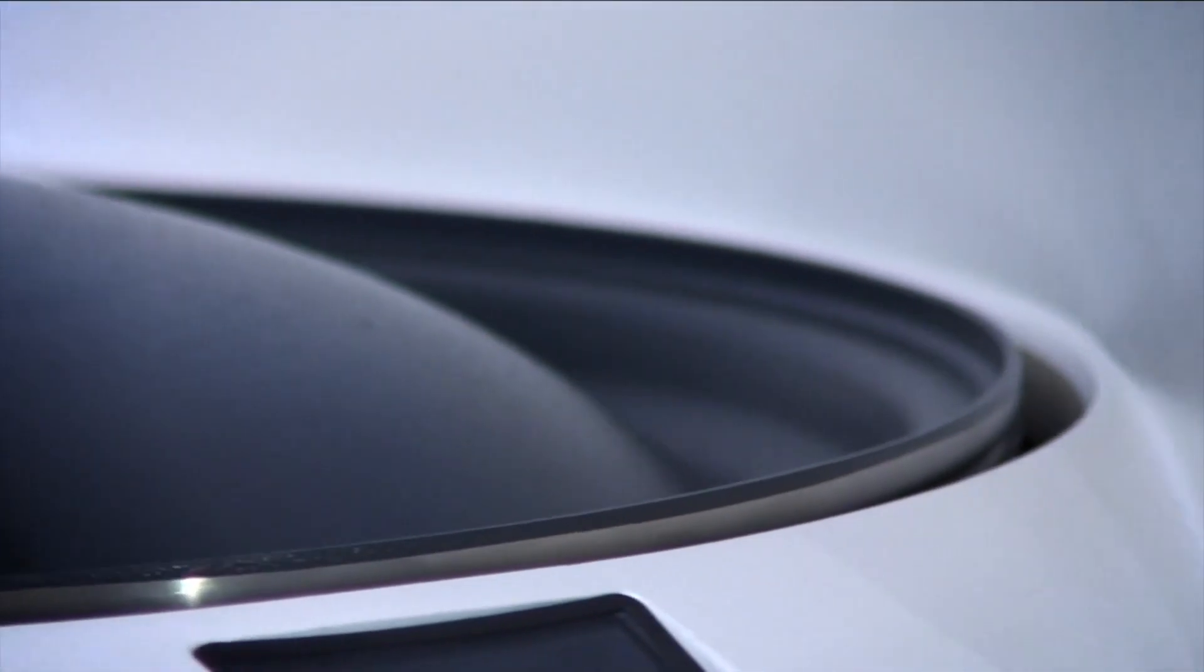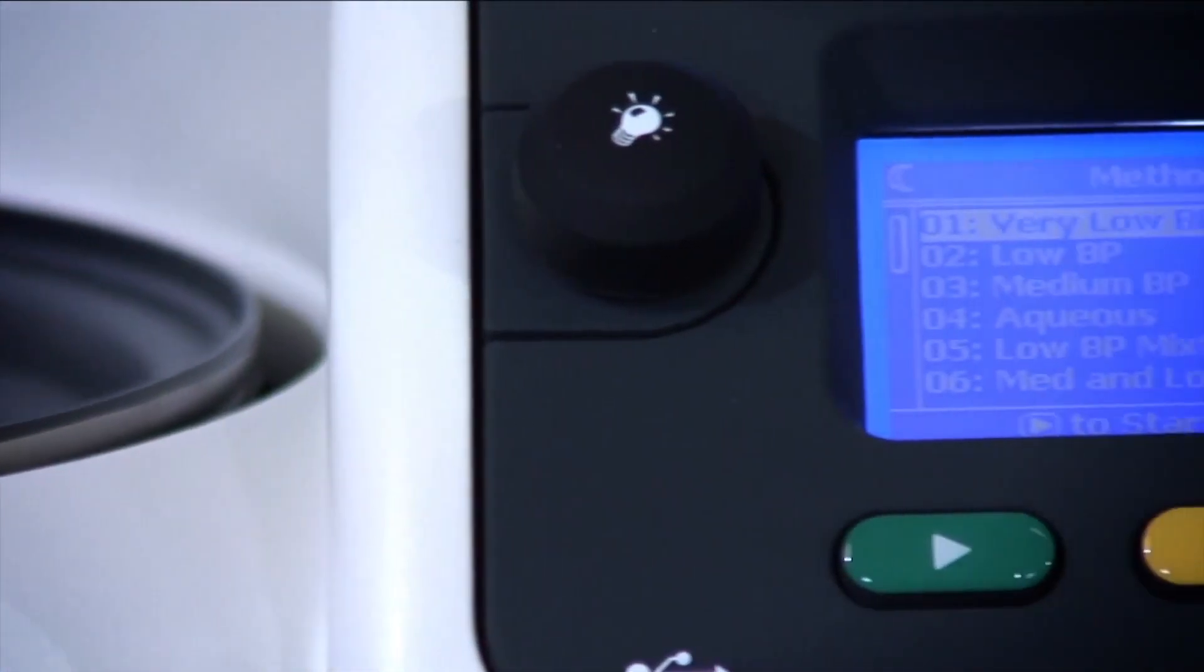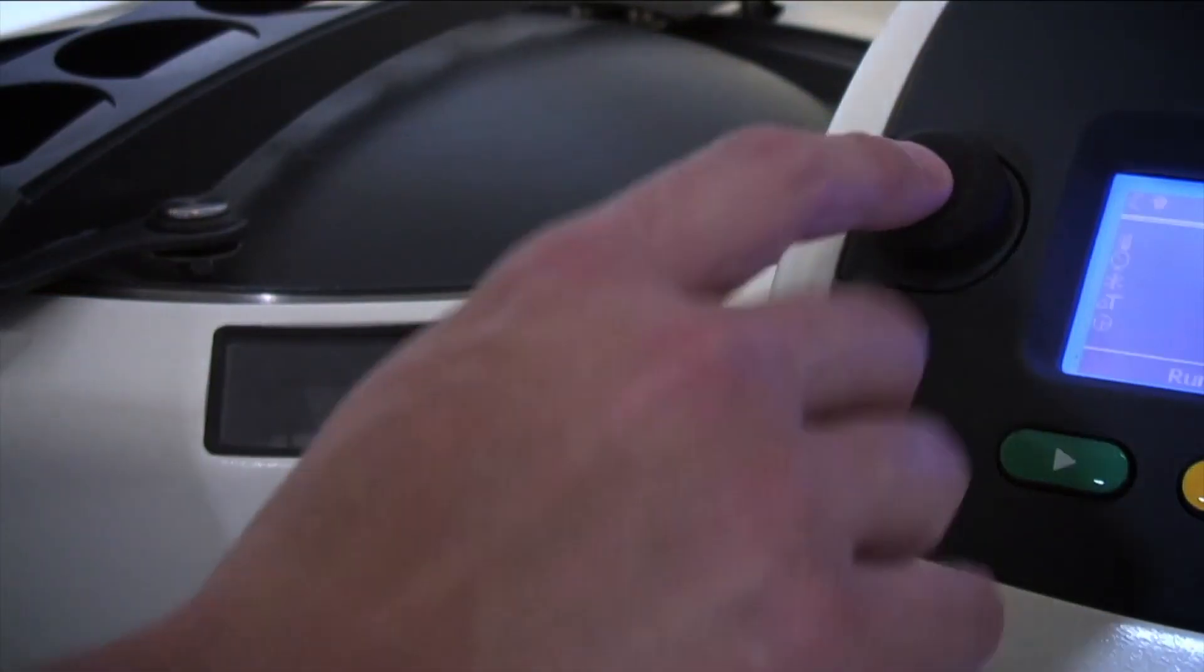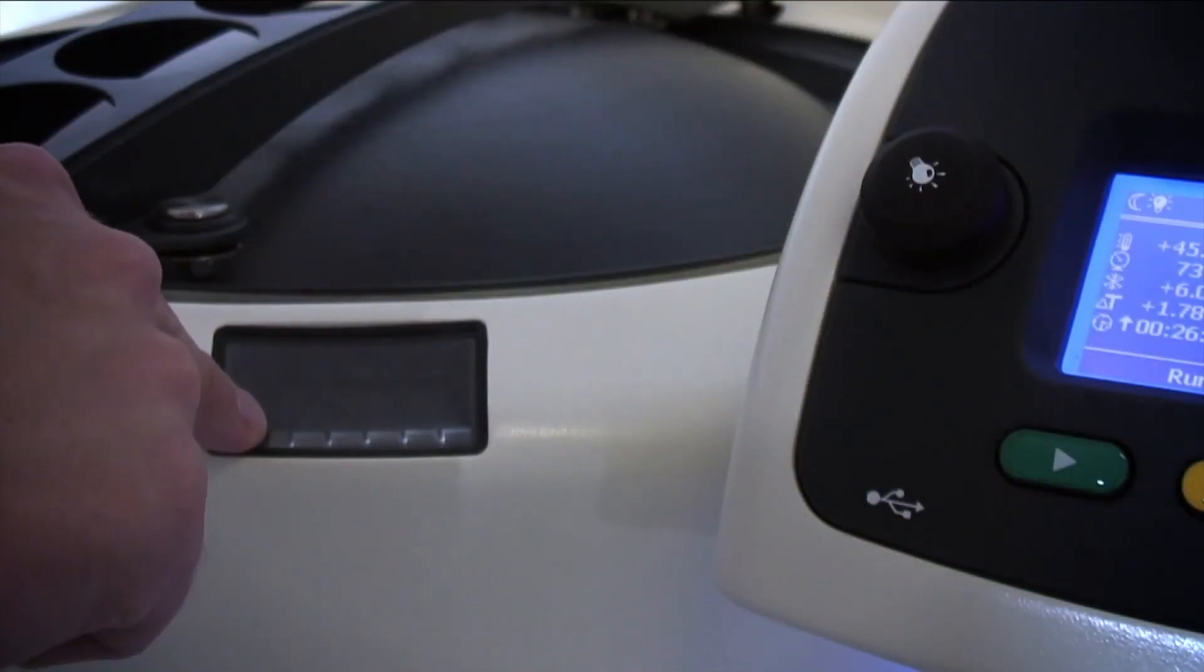The vacuum is provided by a robust, oil-free, solvent-resistant vacuum pump. The system is operated via the simple controls. A built-in strobe lamp enables each sample to be viewed separately and in real time during the evaporation process.